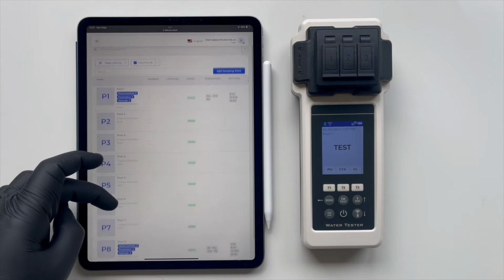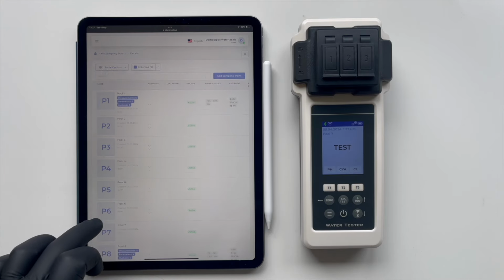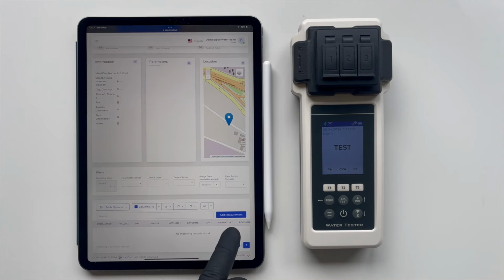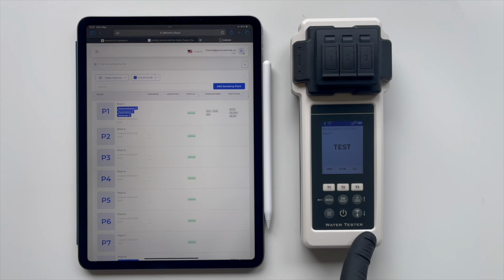This visibility allows us to easily manage and review data from each specific location, providing a centralized overview of all testing activities and results. Similarly, in the cloud as well as in the app, we have the ability to interact with this data, applying filters, analyzing trends, and generating reports that help in making informed decisions about water quality management across various locations. We notice that the sampling point has no data. Although we have conducted the tests, the results have not yet been downloaded to the cloud storage.